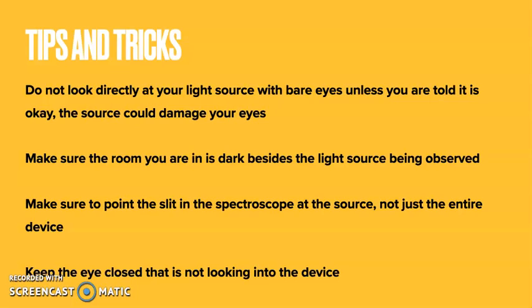Here are some tips and tricks when you use a spectroscope. Do not look directly at your light source with bare eyes unless you are told it is okay. The source could damage your eyes.